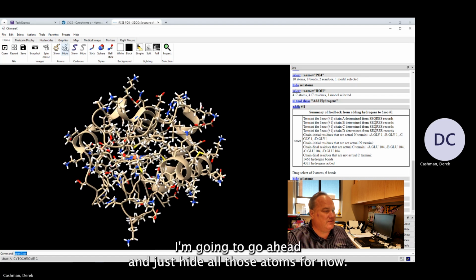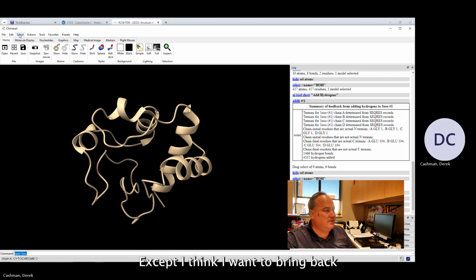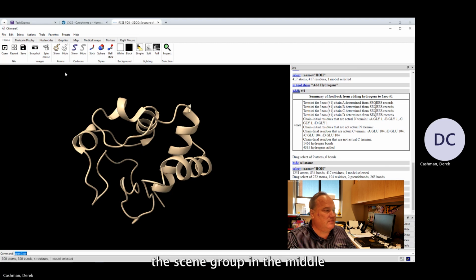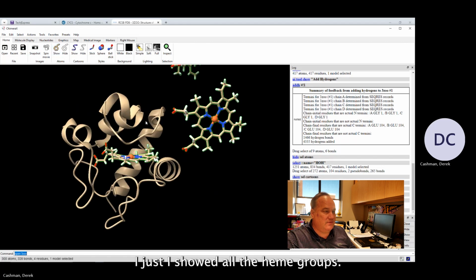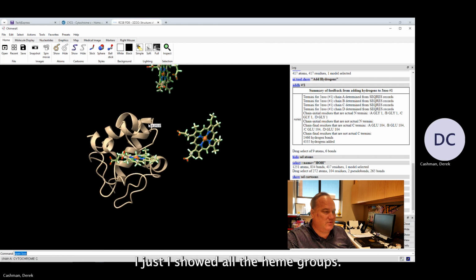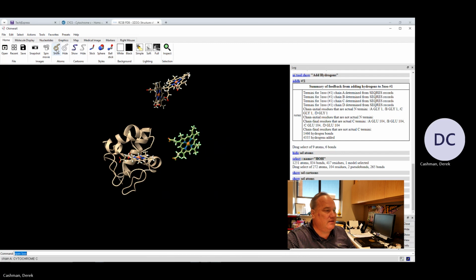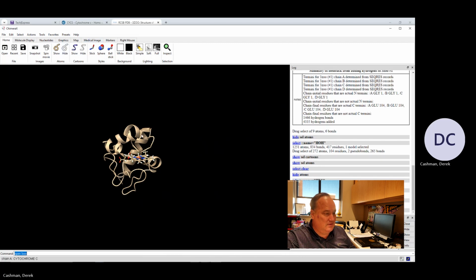I'm going to go ahead and just hide all those atoms for now, except I think I want to bring back the heme group in the middle. And whoops, I showed all the heme groups. I didn't want to show them all. So now let's just get rid of that and hide you guys.